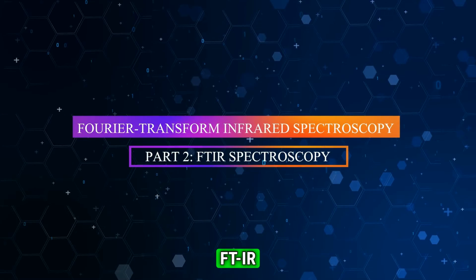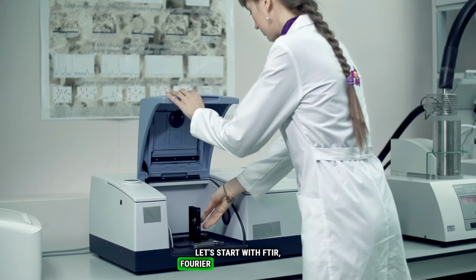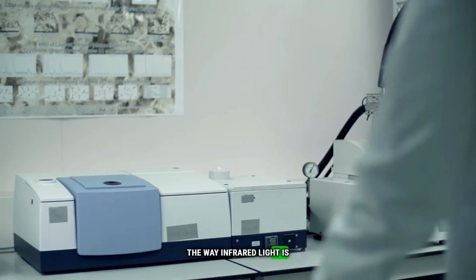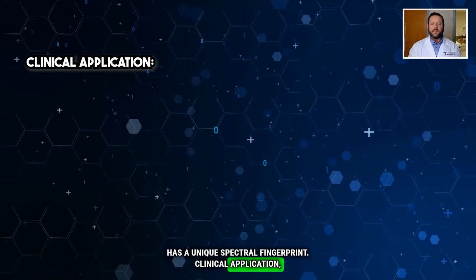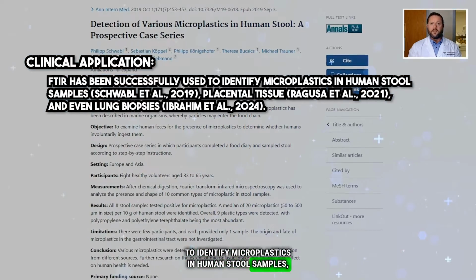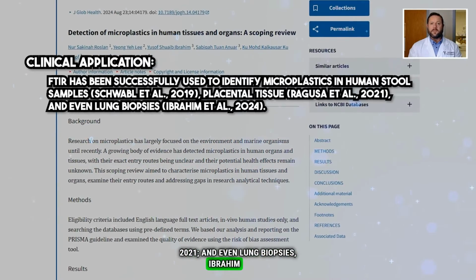Part 2. FTIR Spectroscopy, Fourier Transform Infrared Spectroscopy. Let's start with FTIR. This technique analyzes the way infrared light is absorbed and scattered by materials. Each type of polymer, whether it's polyethylene, polystyrene, or PET, has a unique spectral fingerprint. Clinical application: FTIR has been successfully used to identify microplastics in human stool samples, Schwabl et al. 2019, placental tissue, Ragusa et al. 2021, and even lung biopsies, Ibrahim et al. 2024.